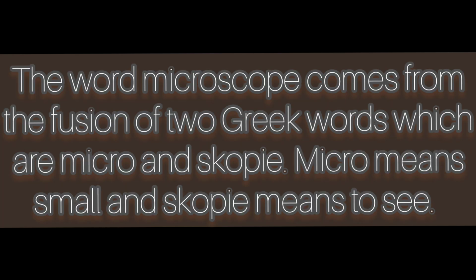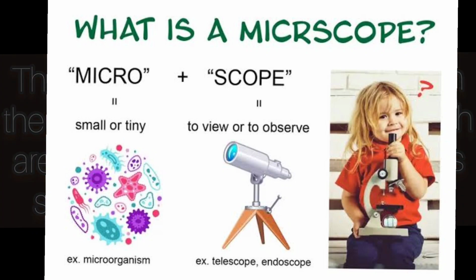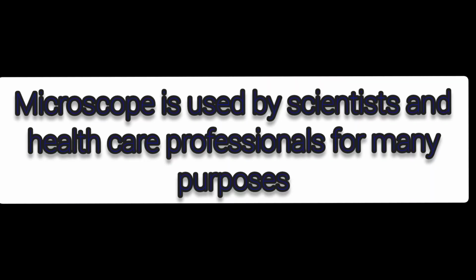Today I'll be talking about microscope. I'll be talking about the principle, the components, the types, and also maintenance of microscope. The word microscope comes from the fusion of two Greek words which are micro and scopy. Micro means small and scopy means to see. Microscope is used by scientists and healthcare.